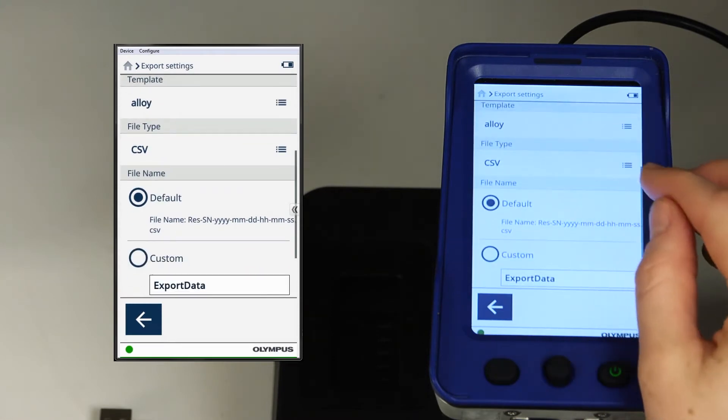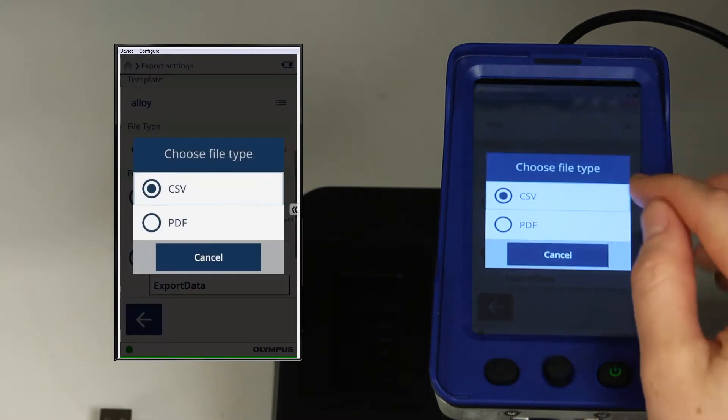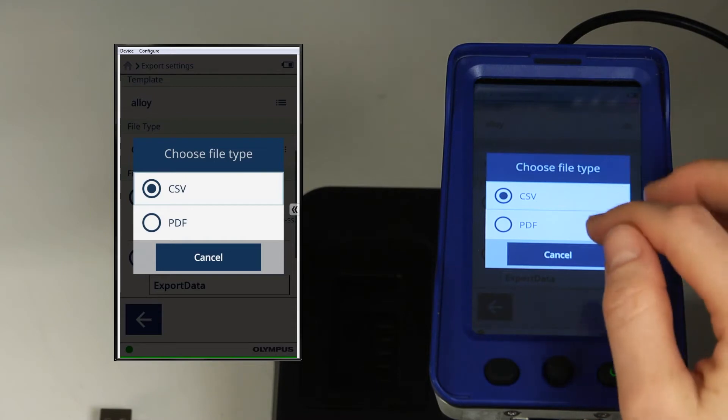Next, you have file type. The two options for file type are CSV and PDF.